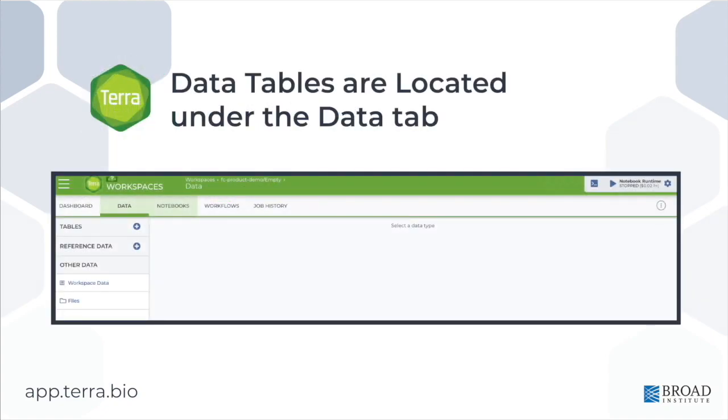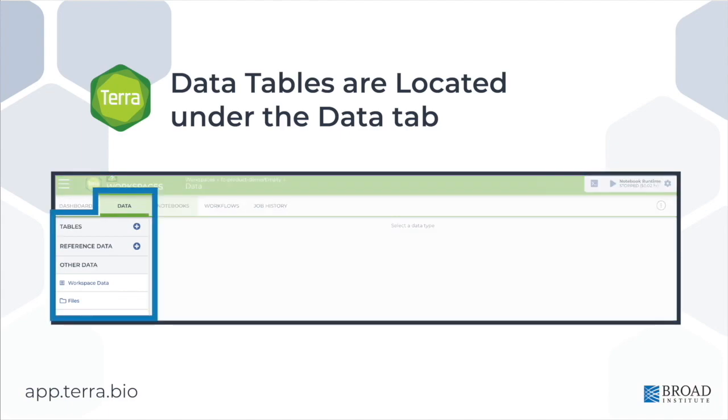Tables are located under the Data tab in the Terra workspace. The tables in this section keep your metadata organized in the way necessary for the workflows to handle them, and this section of the workspace can be found by clicking the tab labeled Data when in any workspace.